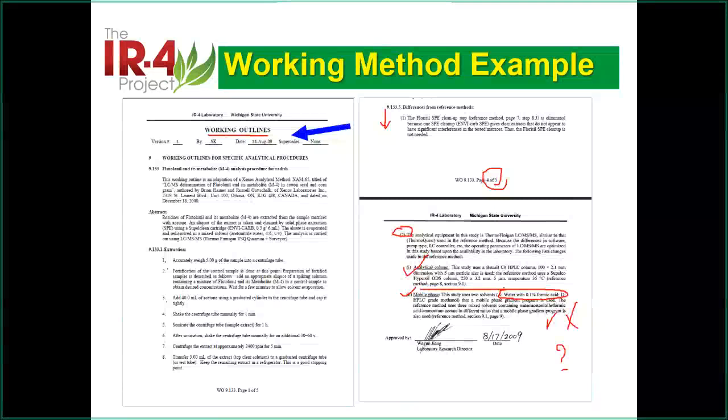So we give this to the study director and just tell him, yes, we did that. This is working. The study director will go through that, read against the method, and say, oh, this is big, this is small. Okay. So the requirement for these working methods is the same as the SOP, because we put our method as an extension of the SOP. So we have an SOP book. The method is only one part of that.